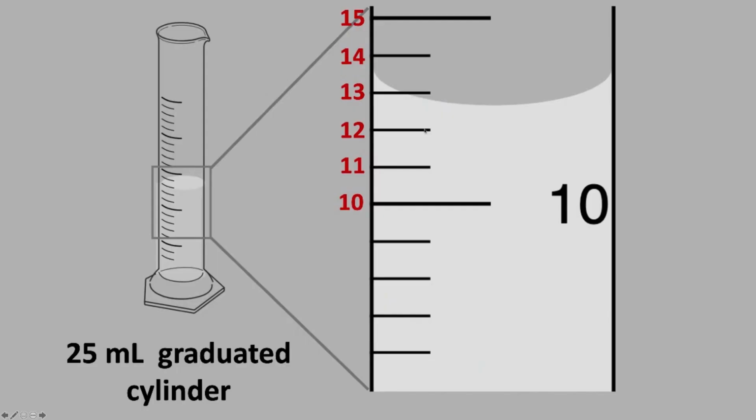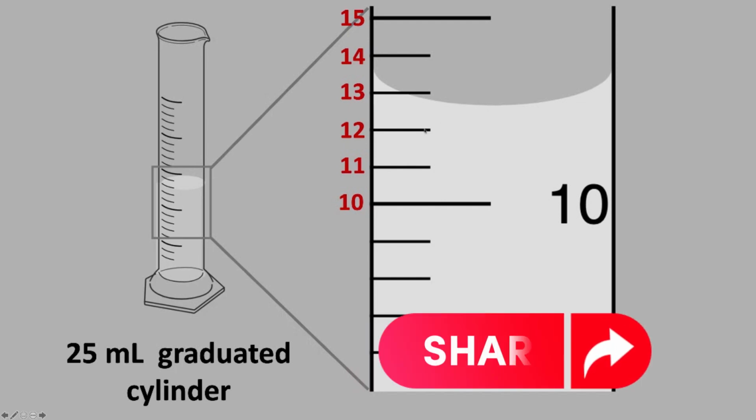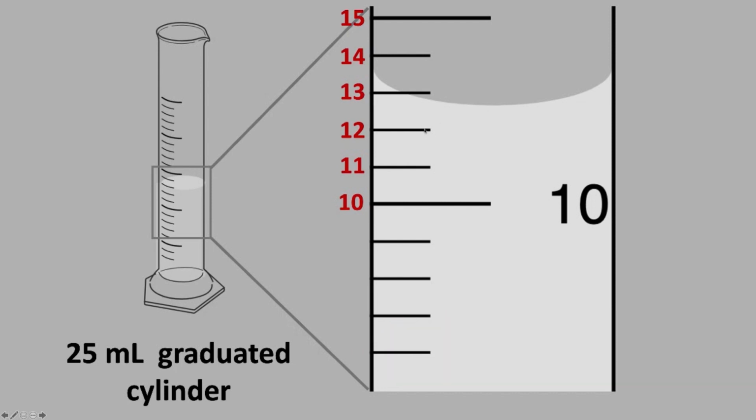Volume graduations. Measuring cylinders are marked with calibrated volume graduations, usually in milliliters, ml, or cubic centimeters. These markings enable precise measurements of liquid volumes. Accuracy. Measuring cylinders are designed to provide relatively accurate volume measurements, with the accuracy typically indicated by the instrument's calibration. Higher quality measuring cylinders offer greater accuracy and precision.